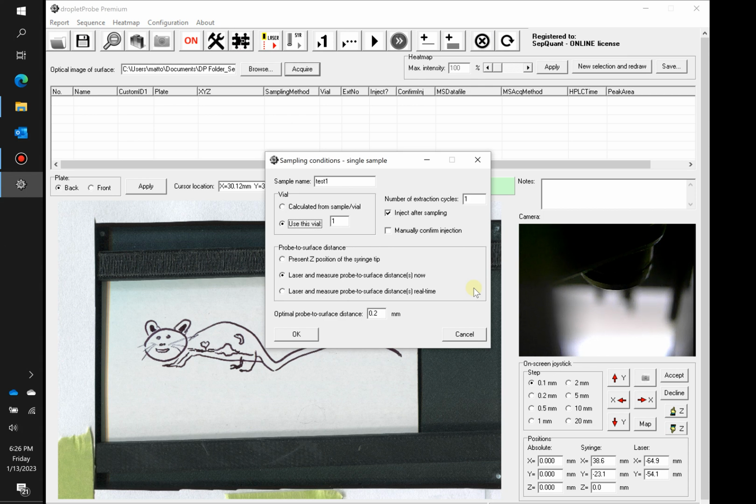If you imagine that you have your sample out for some time, it can get dried up, just like dry skin, right? It's going to start producing peaks and valleys, and the laser usually catches those pretty well. There are some other advanced features that we explain in the manual that will step around with the laser to get an average. But in this case, we just use the real time. That's the best starting point for most people.